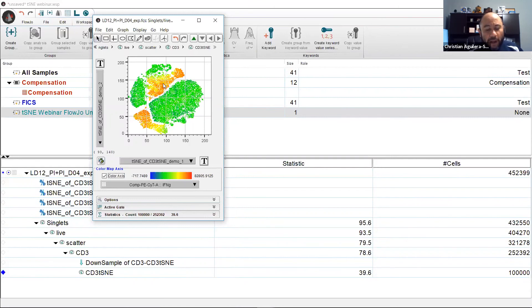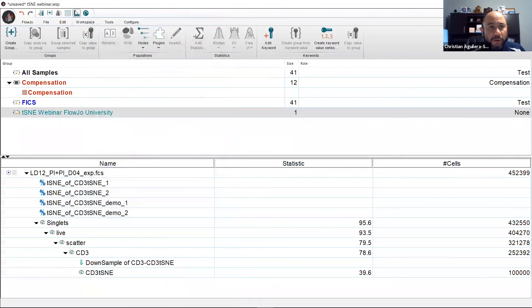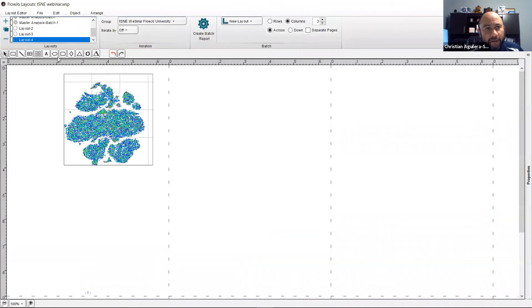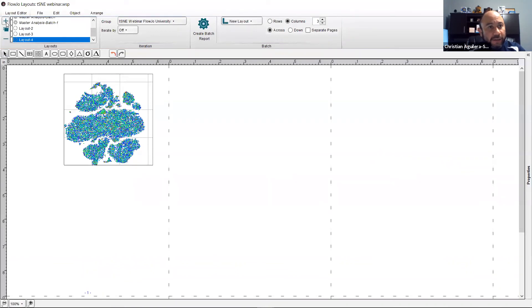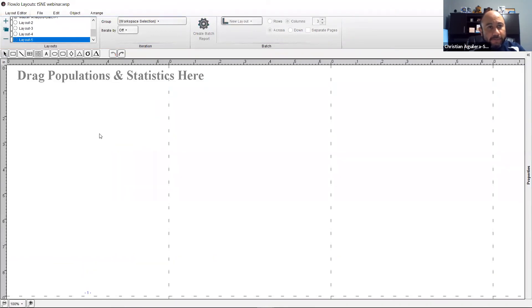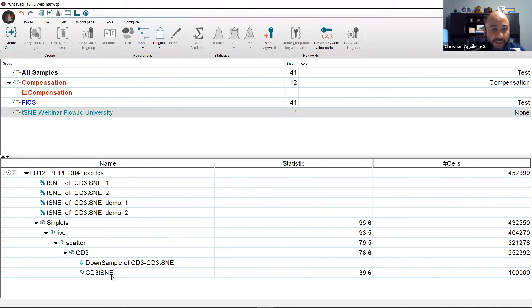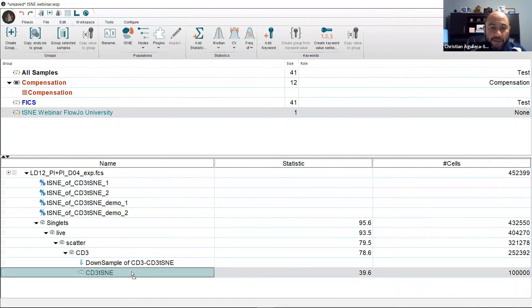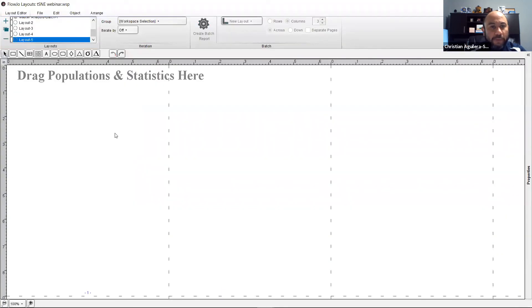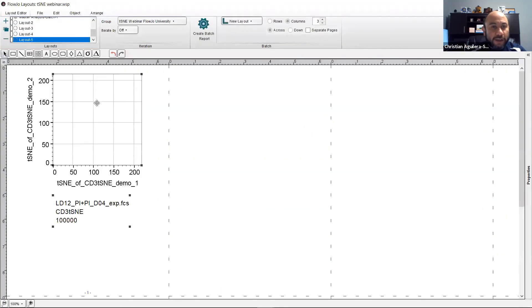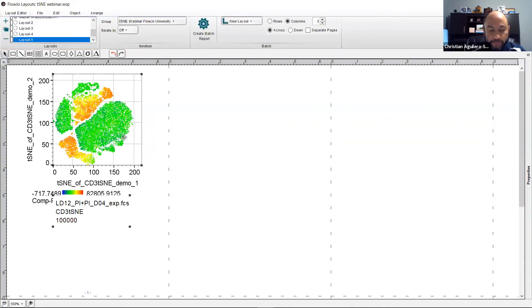Now, how about adding your t-SNE space to your layout editor? Well, let's open our layout editor and create a new space. We select the t-SNE node, the node of interest that we want to drag in, in this case our CD3. We're going to click drag and drop onto our layout editor and there you go.